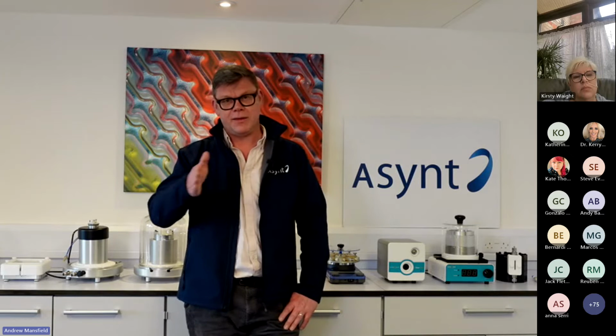I would say it is. Yeah. So it depends how long you want to run your campaign for. There was a paper from GSK a couple of years ago, and they only produced 1.5 kg, but they did that in 6 steps, and I think that was just probably for the working day. So it is applicable for scaling up in batches, and all of those benefits we spoke about, if you've made the solutions up in the right concentration, that batch to batch variation should be lessened as well. So I would say it is, yeah. Okay, fantastic.